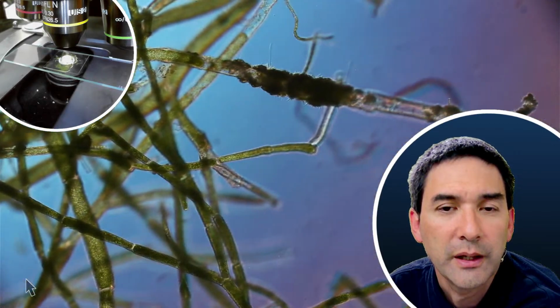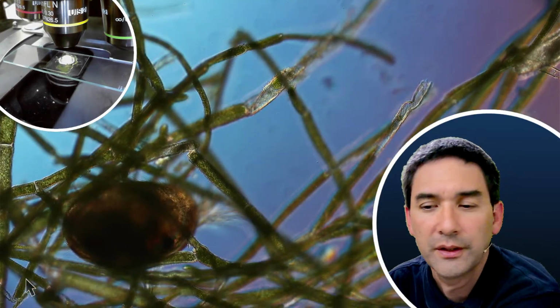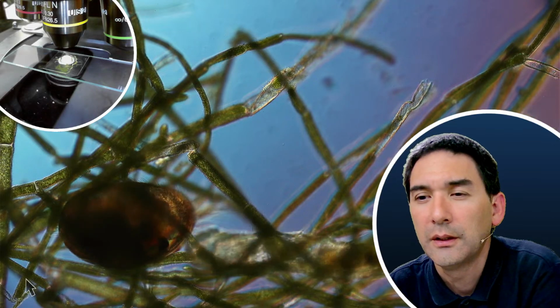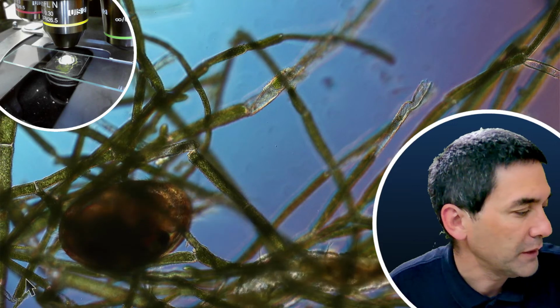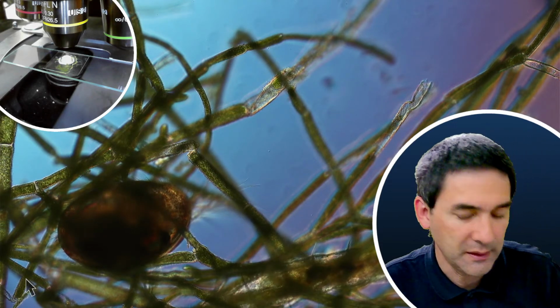So what else do we have here? Just for the fun of it, because I've also not looked at the sample for 1 week, I would like to put in the one water sample from the Baltic Sea.